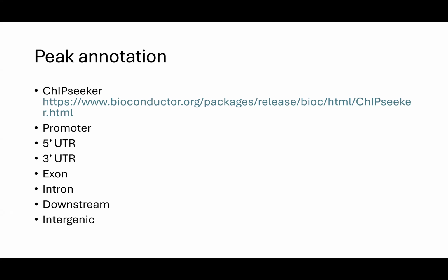If you have a total change in the histone modification or the transcription factor binding, you could do a Western blot. You can do chromatin immunoprecipitation and then do a Western blot for how much chromatin is bound. ChIP-seq is also compatible with qPCR, so you can do the immunoprecipitation and then do a specific target for PCR.